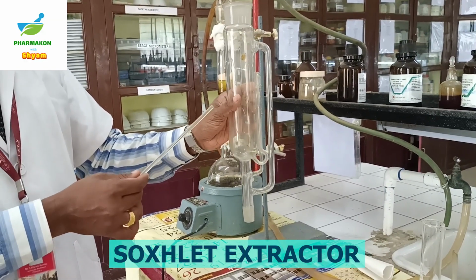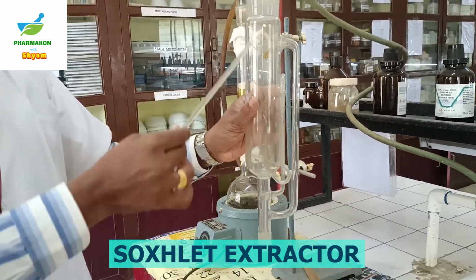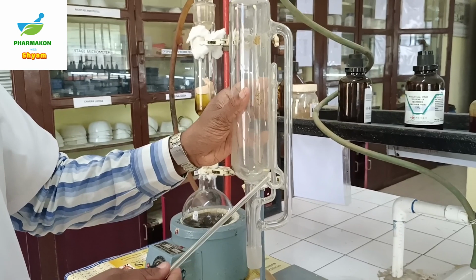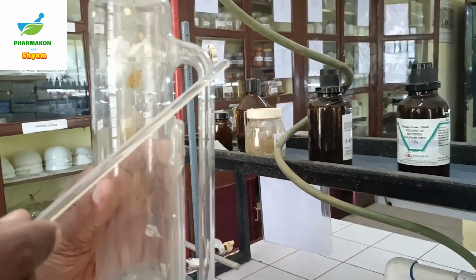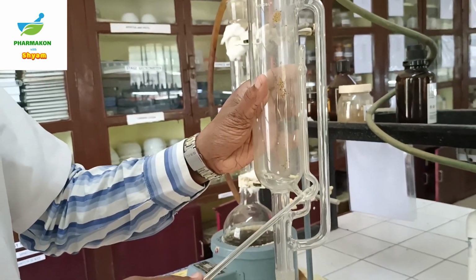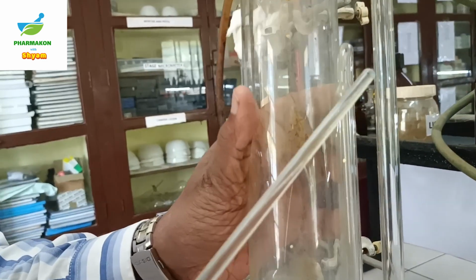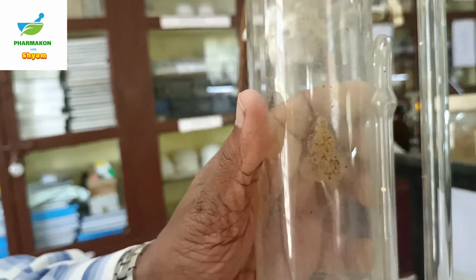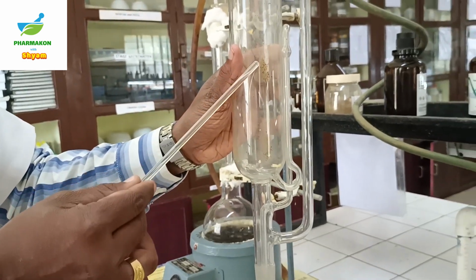Step 2. Explanation of the Soxhlet apparatus. So this is the Soxhlet apparatus. The larger tube is called the vapor tube. The smaller one you can see is called the siphon tube, and this is the area where the drug is packed and the extraction takes place.